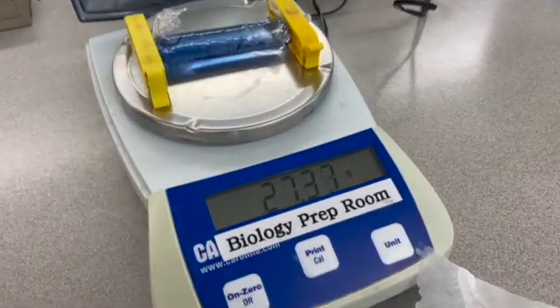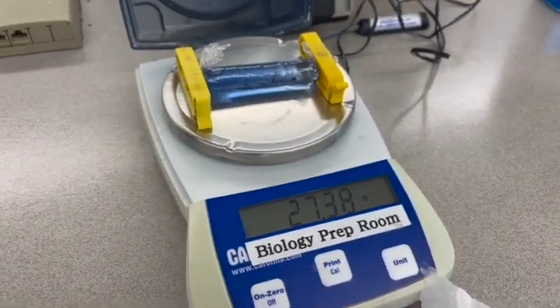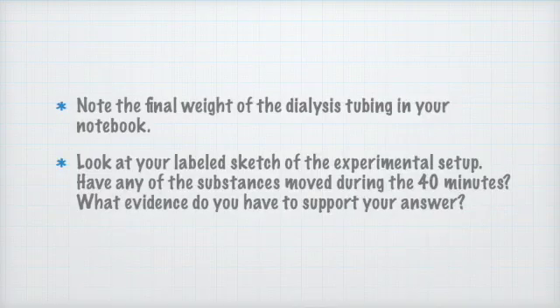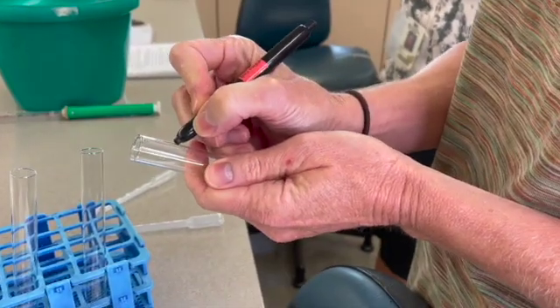The dialysis tube looks a little more plump. Let's note the final weight. We now prepare for the Benedict's test.